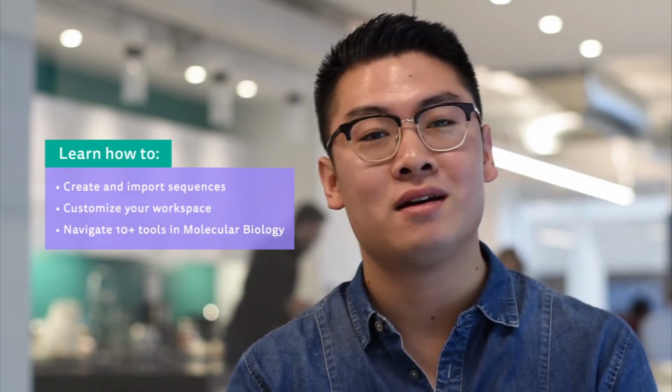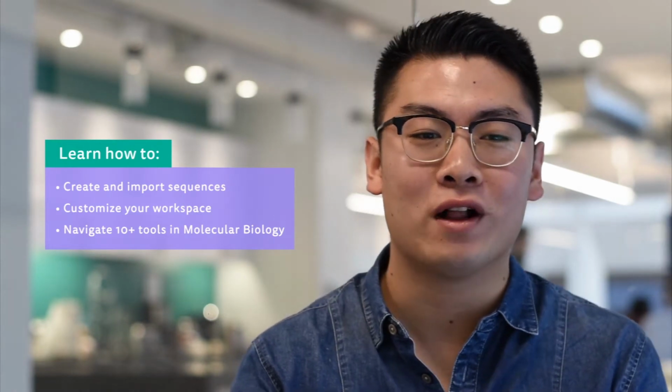Let's get started with the molecular biology application. First, we'll show you how to create and import DNA and protein sequences in Benchling. Then, we'll show you how to customize your workspace and how to navigate to each of the different tools in Benchling. We'll follow this video up with a separate molecular biology deep dive, which goes into specifics for several key features.